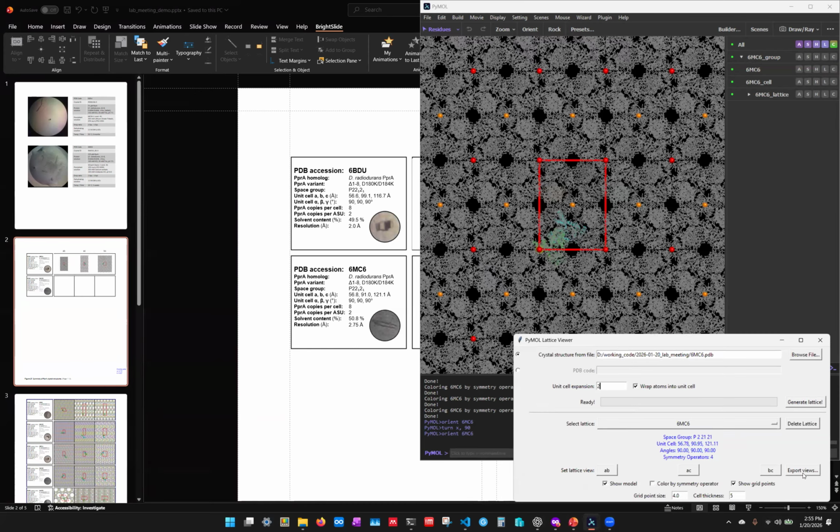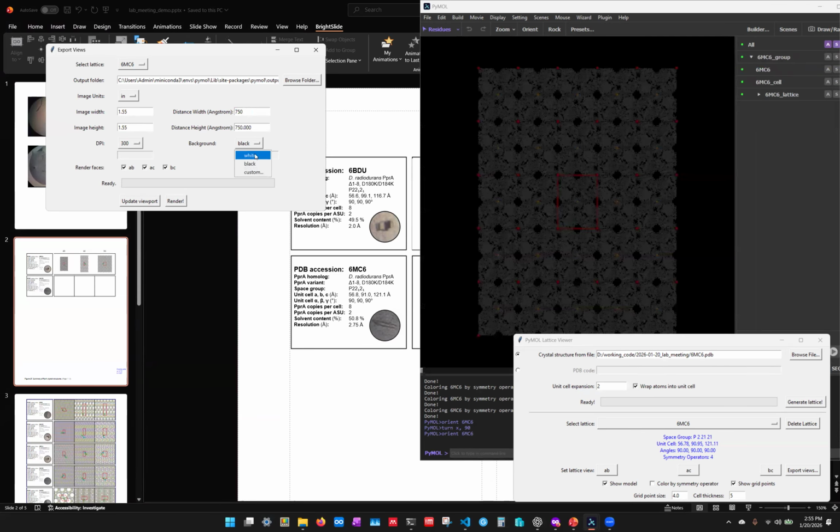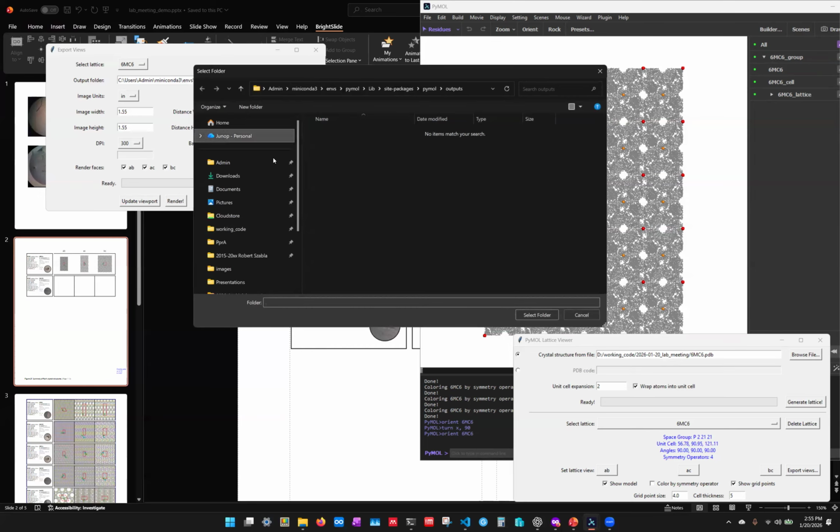Because you always get a list of possible space groups, and sometimes they're basically identical. It's like, okay, how do we know for sure? Well, sometimes you just see if you can solve the structure and how well. If the refinement gets hung up in the 30s, then okay, the data is better than that. There's got to be something systematic.